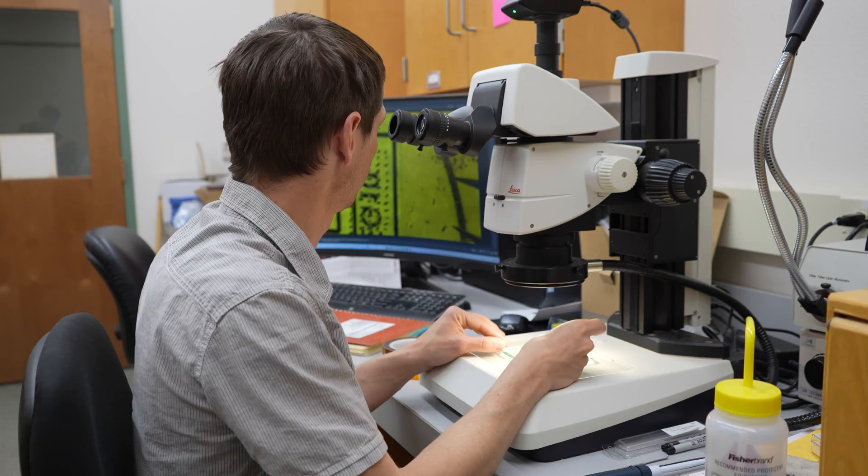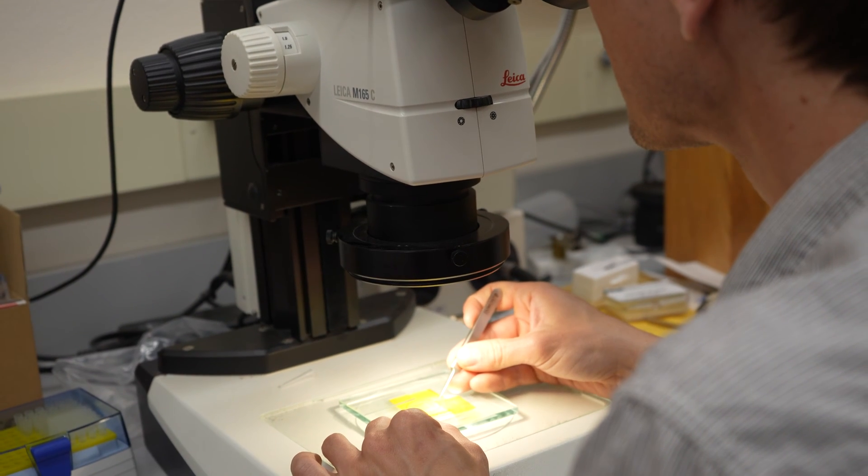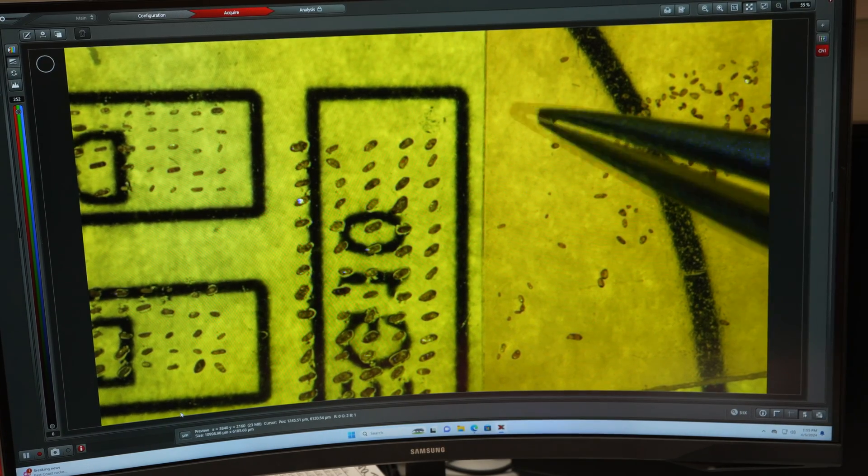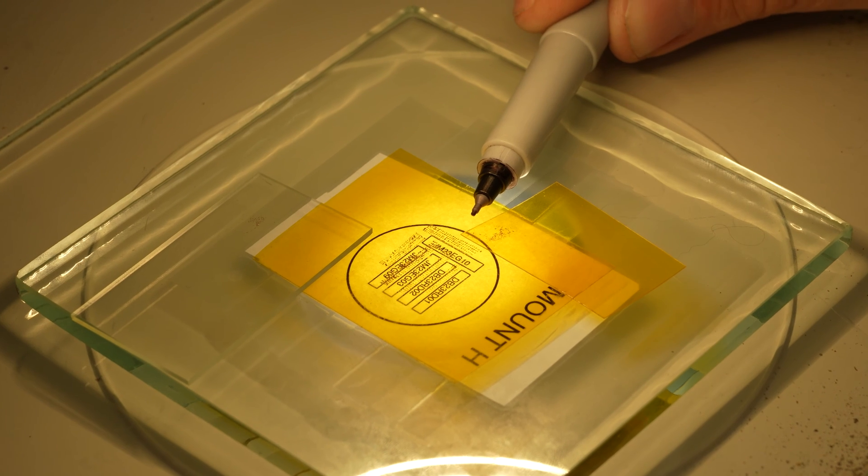Now under a microscope, we handpick individual zircon grains, finding them based on their shape and transparent glassy appearance. By placing them on grids, we can prepare many samples on the same mount for further analysis.